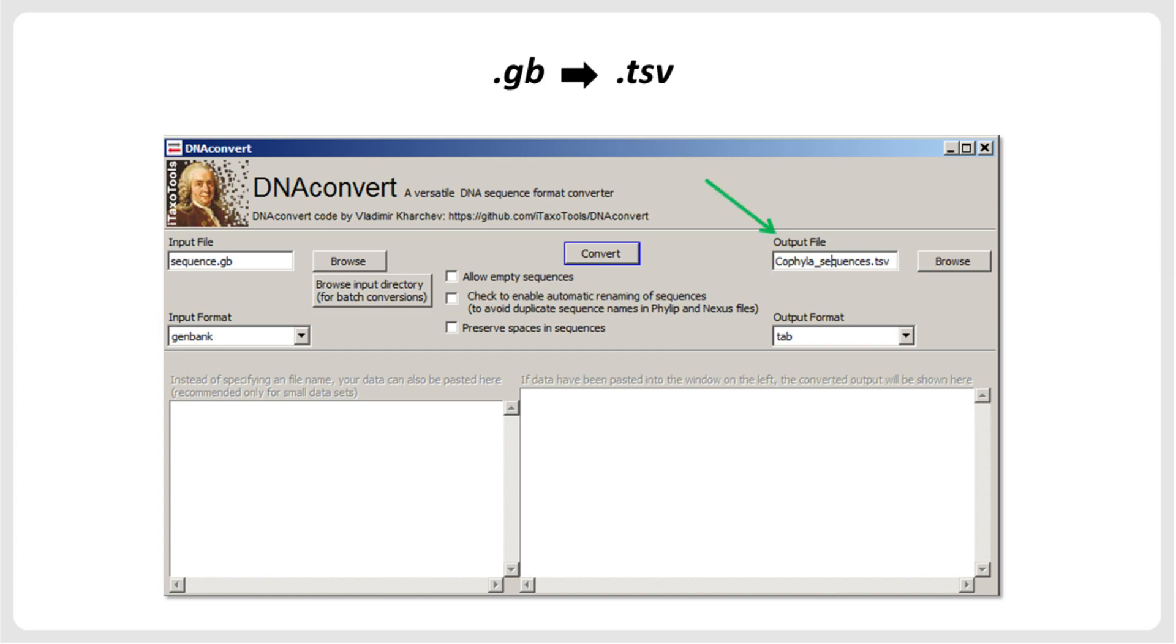We also specify the name of the output file with a more meaningful name, such as cofilosequences.tsv. The output format is specified as Tab. Note that if the file names have the correct extensions, selecting input and output formats is not necessary.